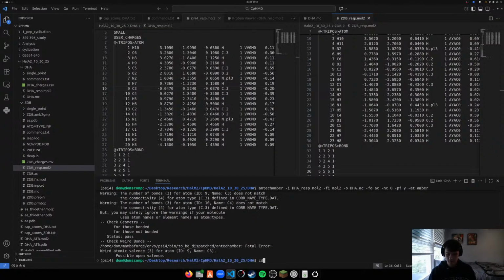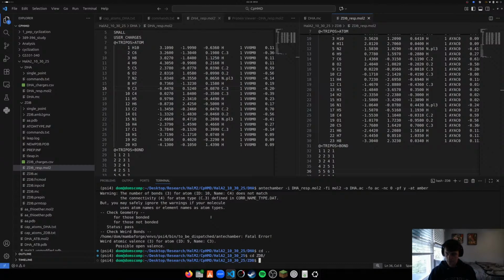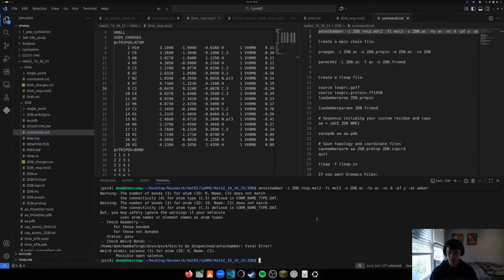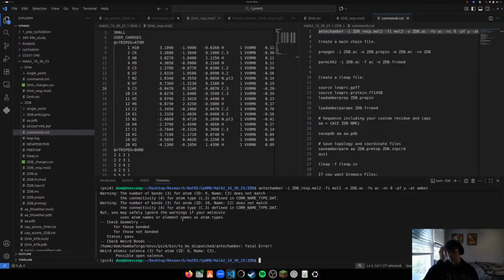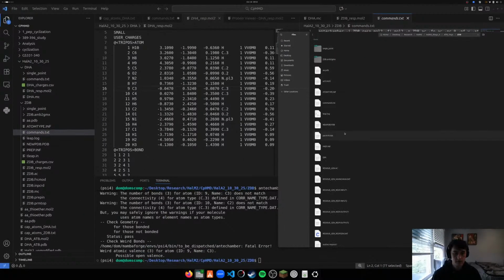Okay, let's try something. See if this works. Yeah, so we gotta fix this too. So I think I did it right here.